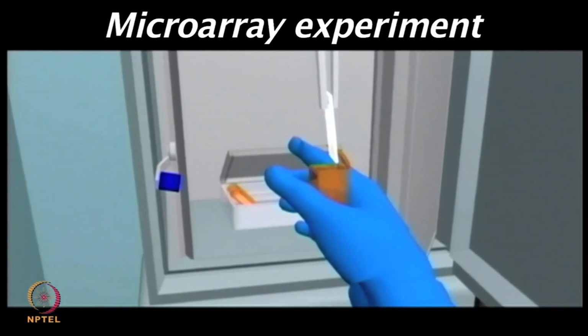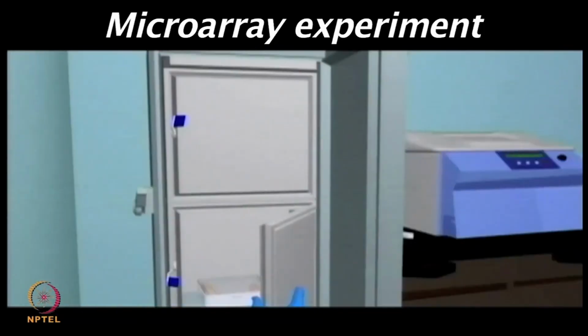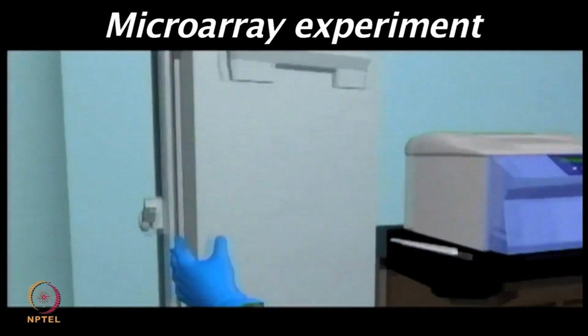In the cell based protein microarray system, the purified proteins are printed on the chip and those are stored at -80 degrees. As you can see in the 3D animation, very carefully the slides were removed from the -80 freezer. And now, one needs to thaw those slides very gently, so as to avoid any diffusion type of effect.